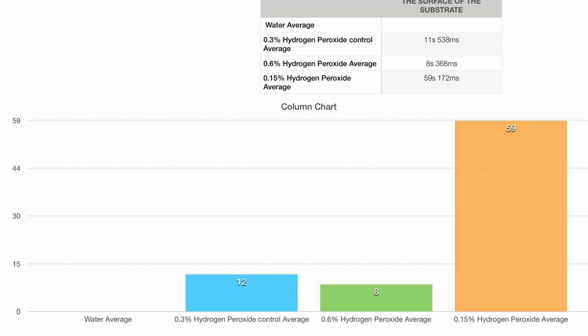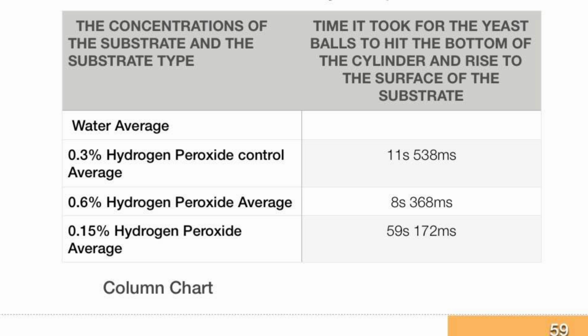The oxygen molecules are a gas, and oxygen gas is much less dense than water at room temperature. Kind of like how lead is quite dense, but it's not as dense as mercury, that's why it floats. Okay? And being less dense, you have a buoyant force of the gas, which effectively pushes up the yeast, making it float to the top. And you can see that in the change of data.